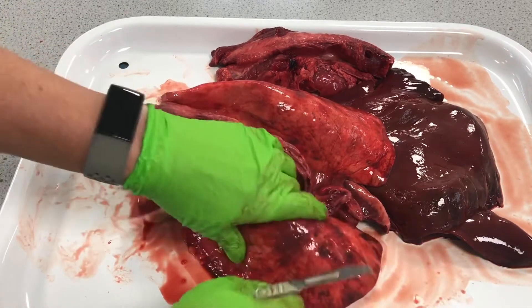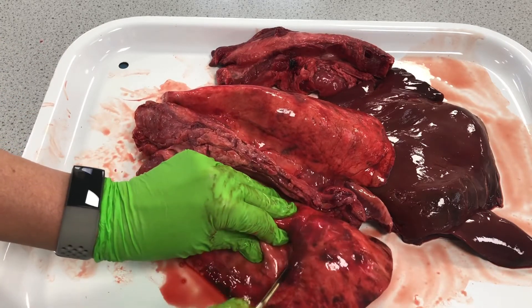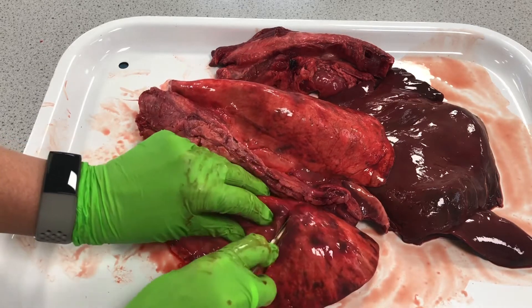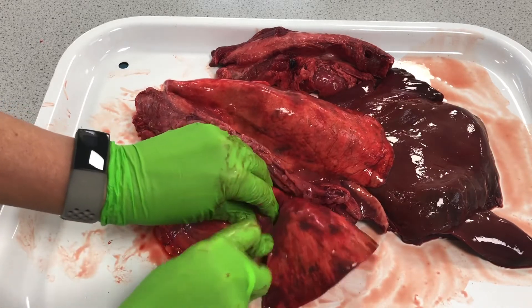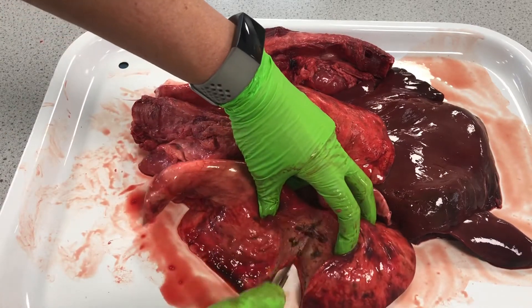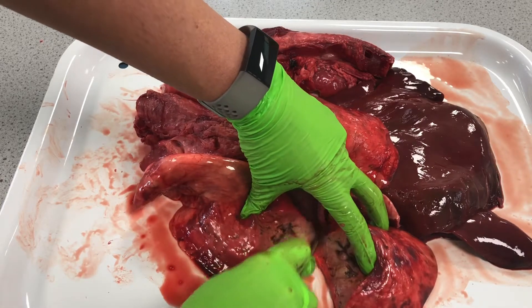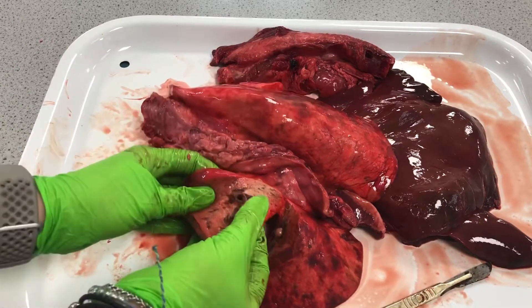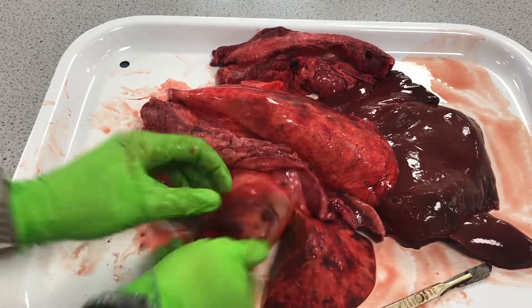Now I'm going to cut straight through this lung so that we can look at those bronchioles, which are reinforced with cartilage to keep those bronchioles open, allowing really good flow of air into the lungs and then that diffusion of oxygen over into the blood. Here we can see a bronchiole with that rigid opening from the cartilage.